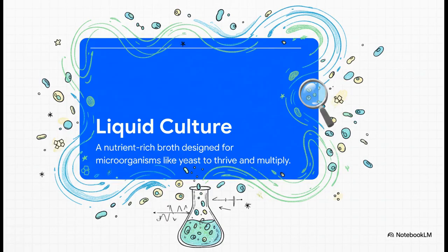So our whole story unfolds right here in what's called a liquid culture. The easiest way to think about it is like a five-star hotel for yeast. It's this perfect, nutrient-rich broth, usually with some sugar, like glucose, that has all the food and goodies these little guys need to just multiply like crazy.